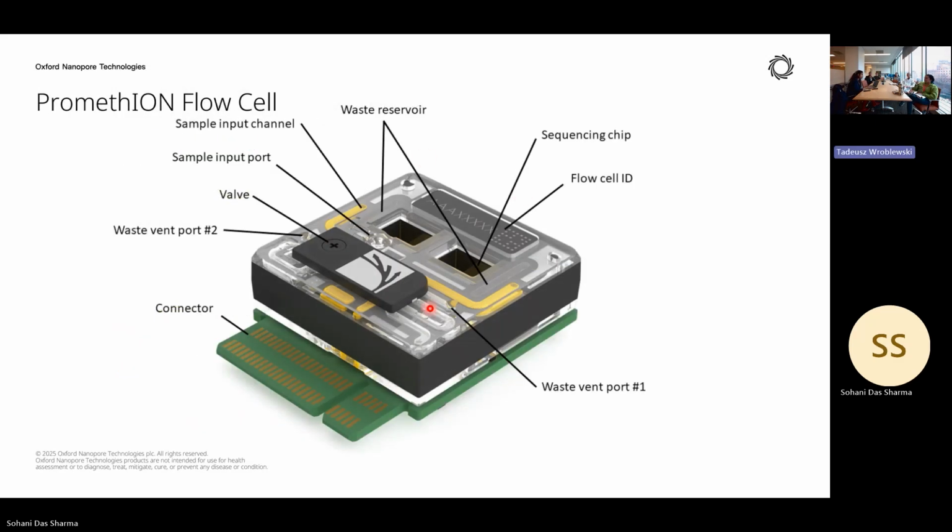When you have fragmentation, right? In bulk sequencing you have many transcripts of the same region. So would it be something like that here? No, you are talking about short read sequencing. Yeah. So short read sequencing is very different, right?